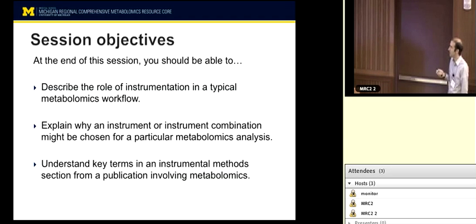Something similar in metabolomics. The way you would measure metabolites used to be by doing biochemical assays one at a time. You'd order a kit, or you would buy your reagents, and you would get an enzyme that would somehow lead to some downstream change in color, and you would put that on a plate reader or a spectrophotometer, and you would measure your color, and that would be proportional to the concentration of one metabolite. And then if you wanted to measure another one, you'd buy another kit or get another enzyme and do the whole same thing. And that still can be useful. There's nothing wrong with that method, but it's very low throughput. And so mass spec has enabled this revolution, the ability to measure many metabolites at once. And of course, you already know that.